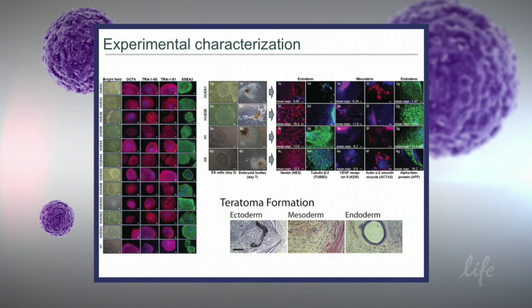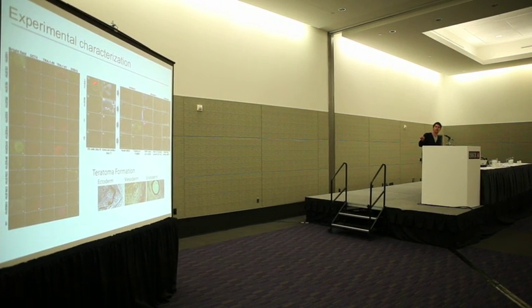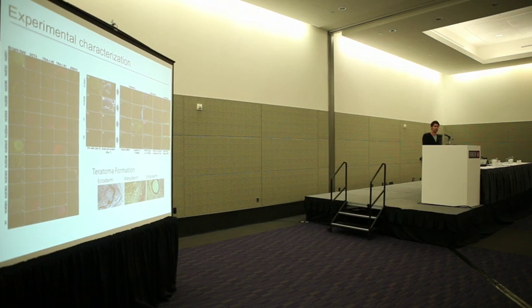So in order to test whether your cell lines are pluripotent, you first put them through an array of immunostainings for different pluripotency markers, surface markers such as the TRA and SSEA markers, or OCT4. On top of that, and again I apologize you can't see this, you differentiate your cells into embryoid bodies. You might plate them as monolayers, then differentiate them into specific cell types, and again immunostain them with another battery of different markers to confirm your cell lines make all germ layers.